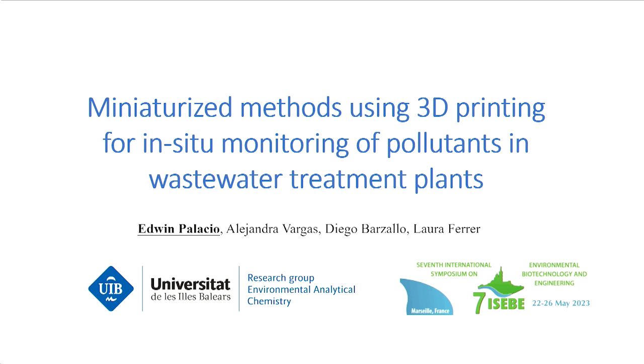Today I'm going to talk about one of the lines of research in our laboratory, which is the development of an analytical method using 3D printing for in-situ monitoring of pollutants in wastewater treatments. In this case, we are focused on waste treatment, but we can use 3D printing in other subjects.